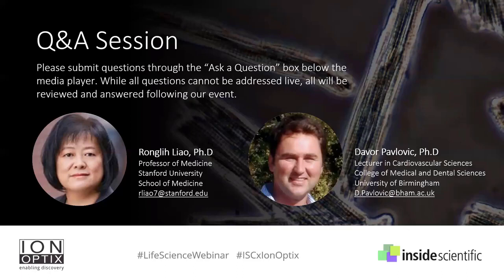Well, as you've seen from my presentation earlier on, in my lab, we use both techniques, actually, because some of the projects we historically used Langendorff for, and therefore continued with it to finish those projects off.